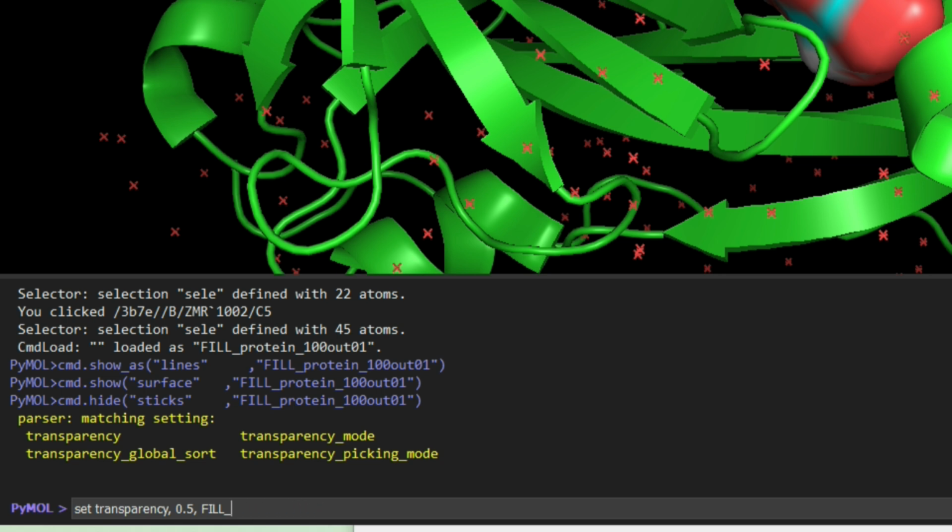So here you can also start with typing the name of the file that we have loaded as surface, and you can press the tab button and it will automatically fill up the selection name that matches with the words you have just typed. So here you can see on the right hand side that there are 5 selections that are present.